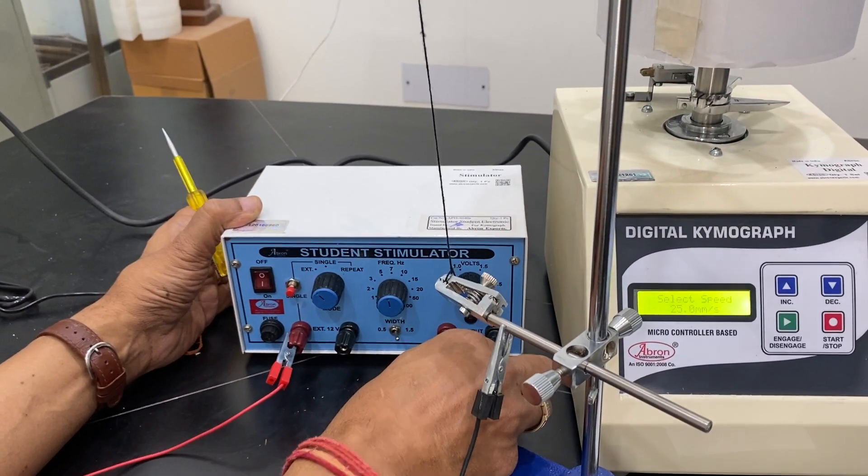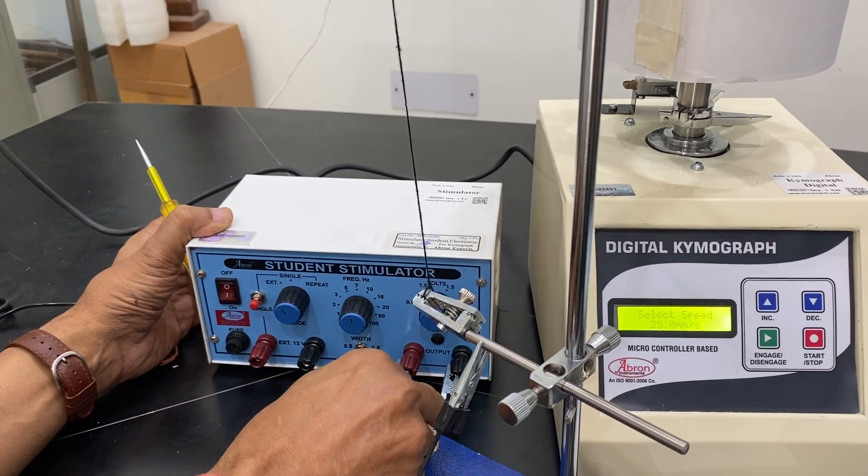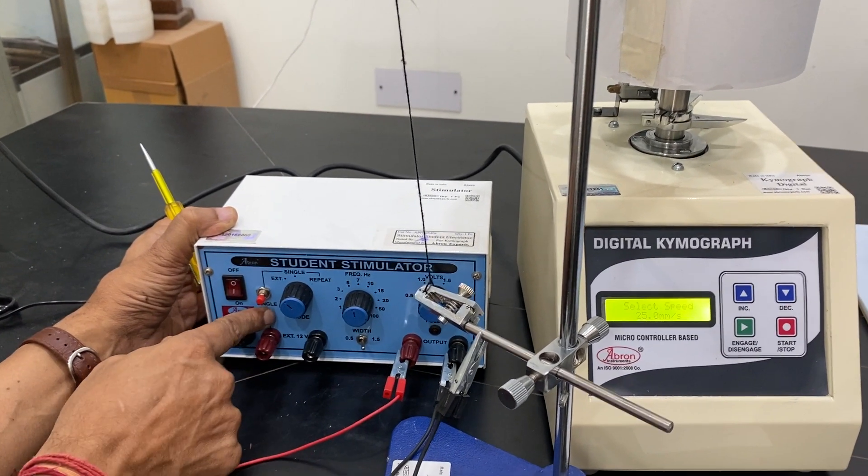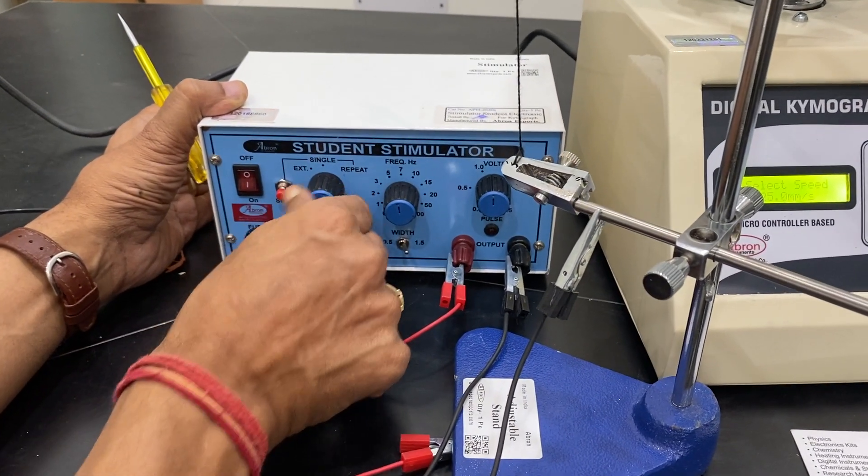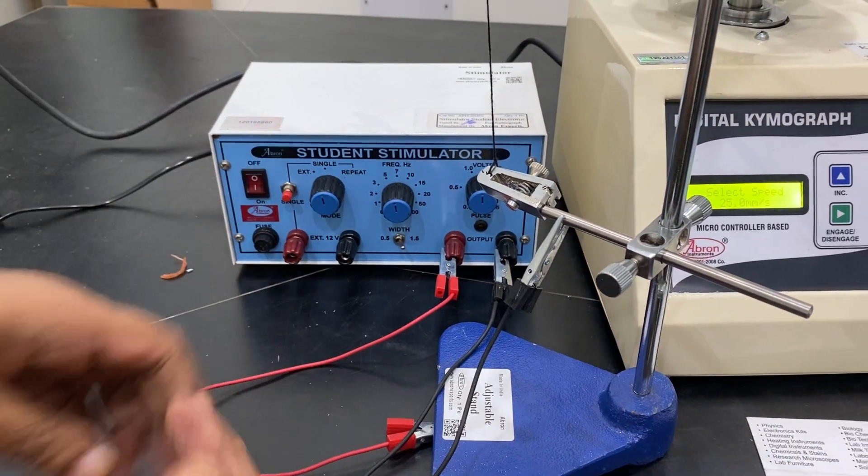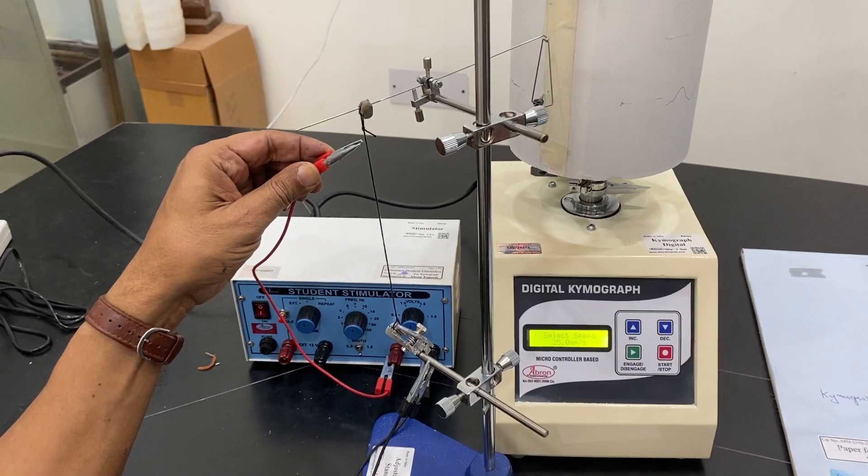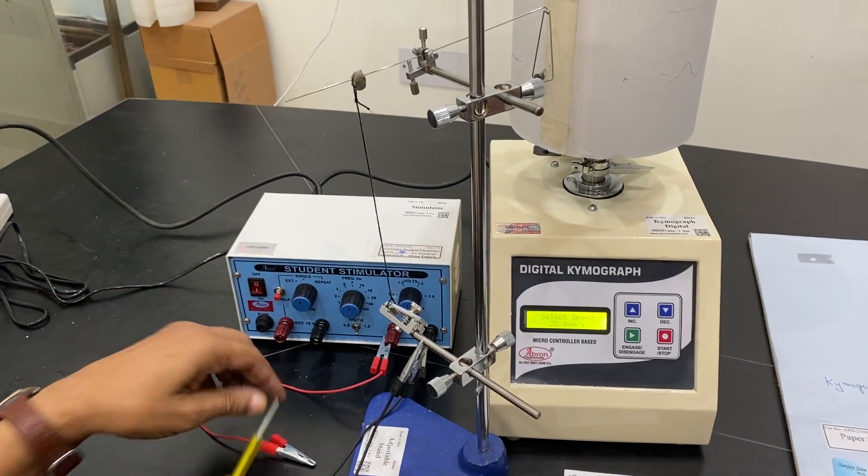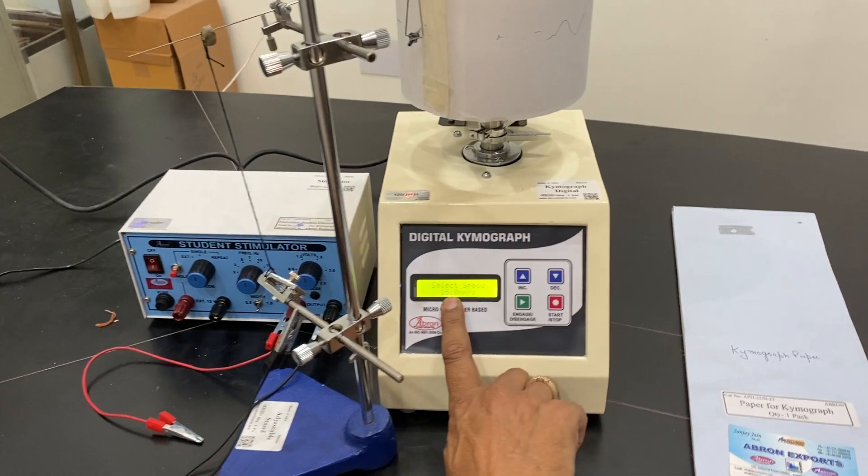I can give you an output from here, connecting to this, and then a single pulse can be given, repeated pulse can be given, or I can give a single pulse using this muscle. I can touch it and it will give a pulse. Now I have done the experiment using a lower speed.